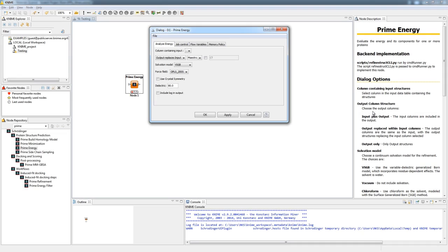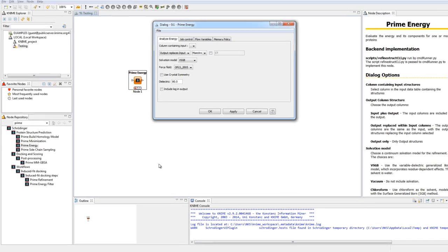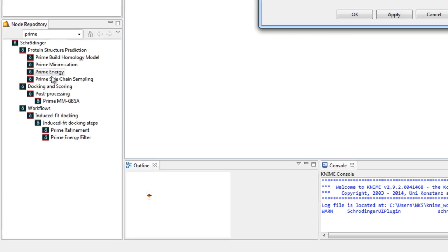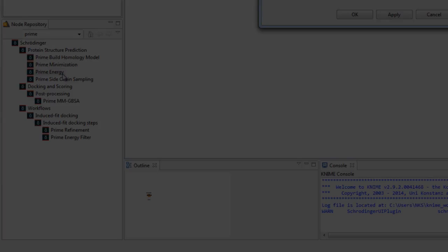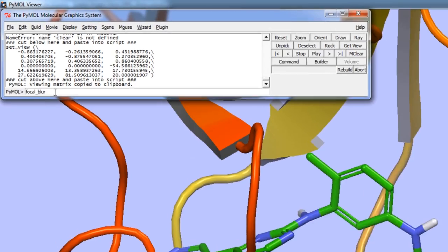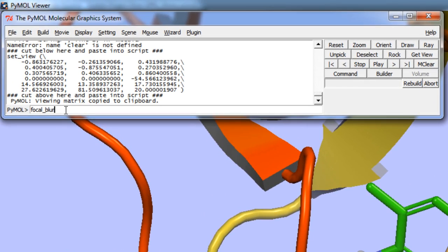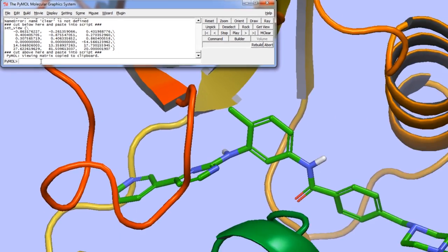Additional new features have been made in KNIME, including new nodes such as the Prime Energy node, and also new features in PyMOL, such as the new focal blur command.